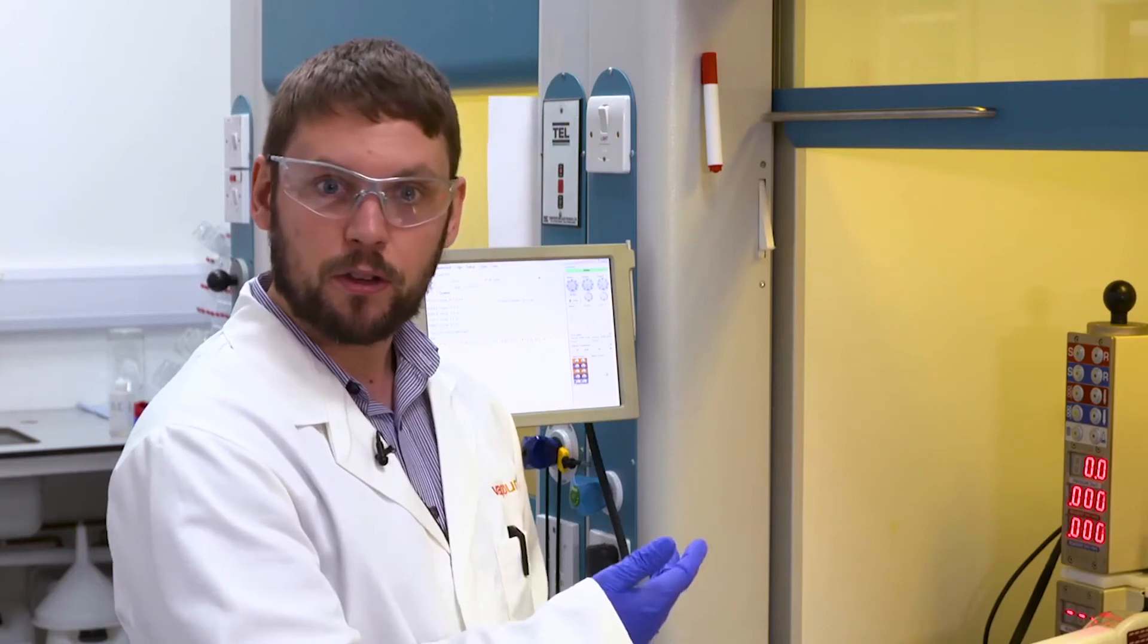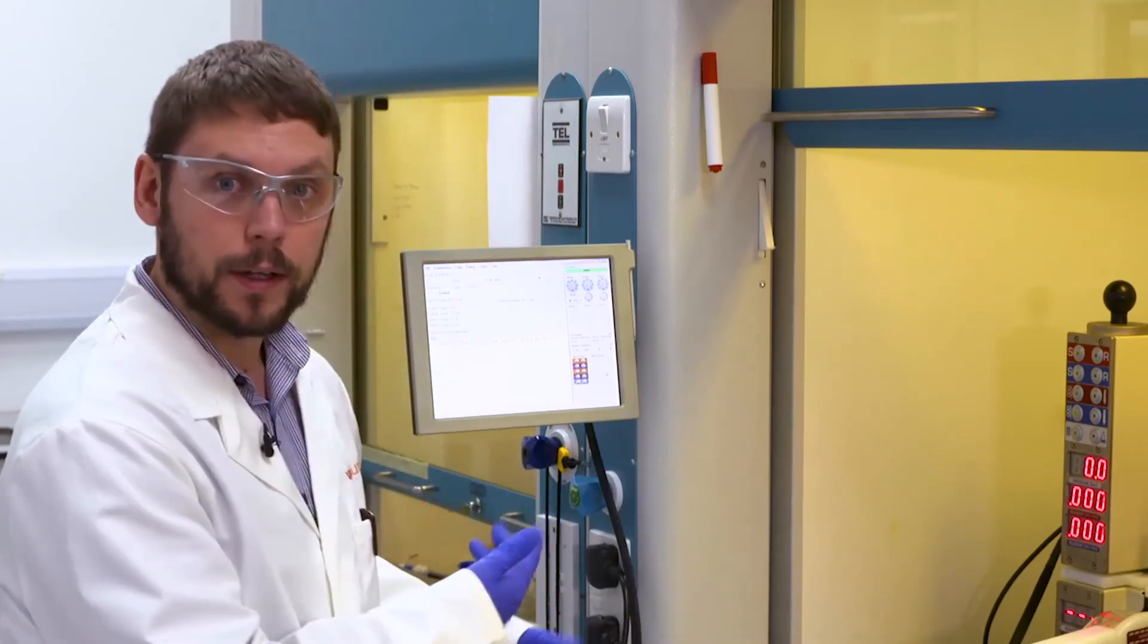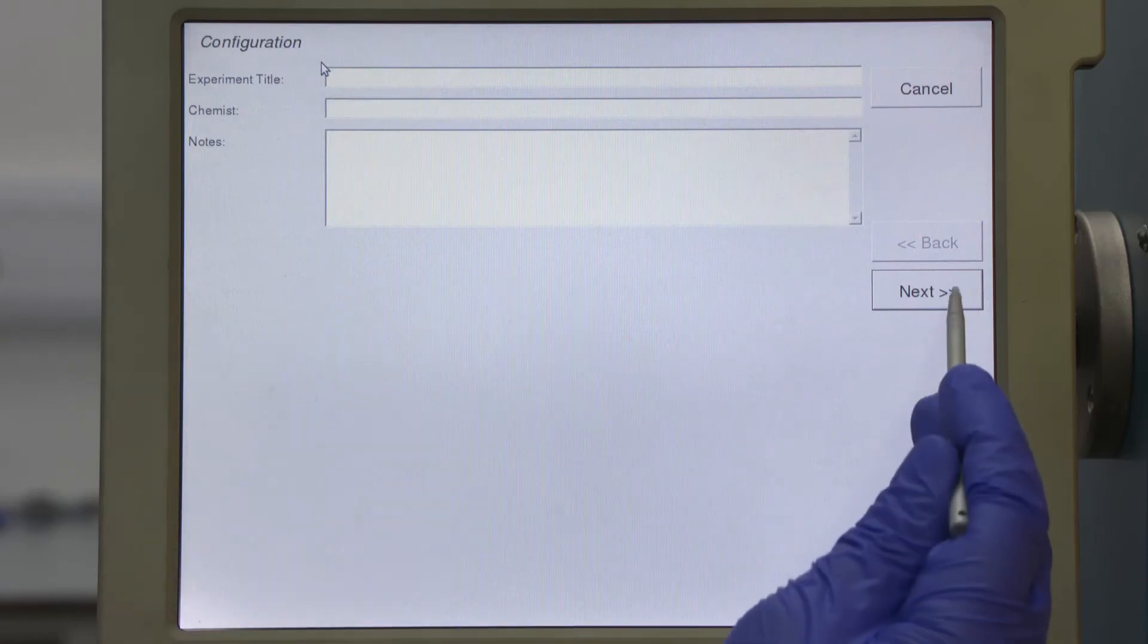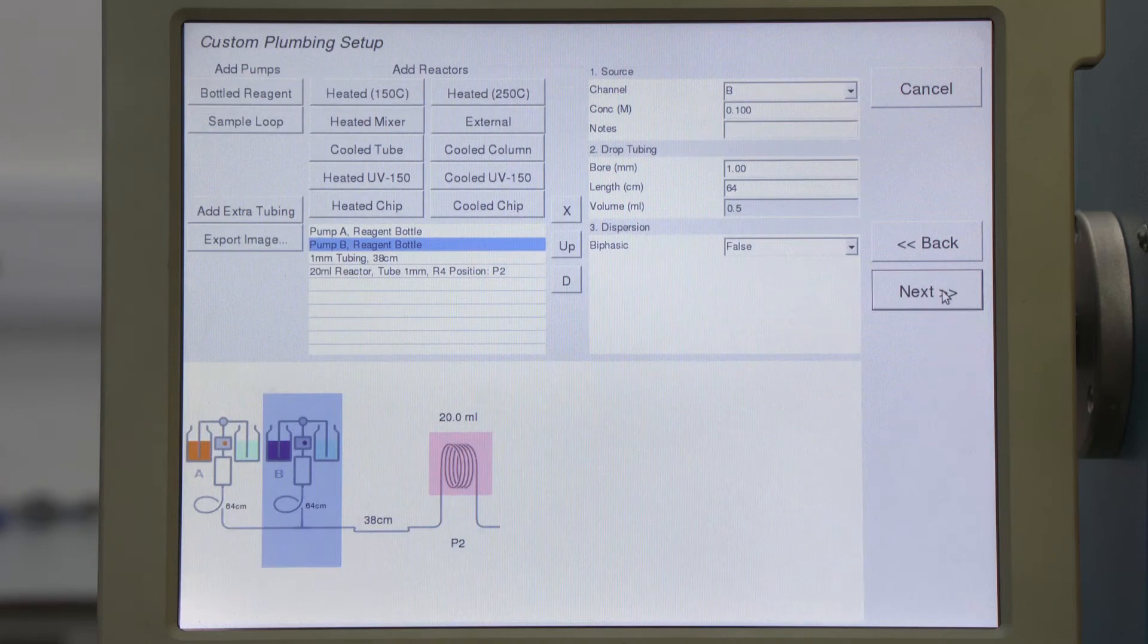Now the reactor system is ready and my reagents are primed. I can design my experiment using FlowCommander. You open a new experiment, input some information about the experiment you're running, then tell FlowCommander what configuration you're using. I ran this experiment earlier today, so the information is already here.